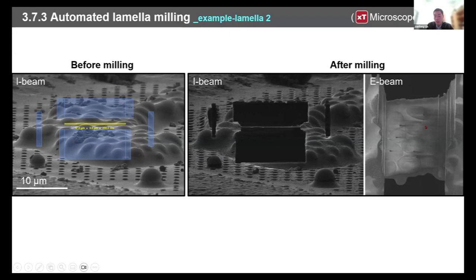In these images, you can see, even though here you will see a little bit of feature, it's still not good enough for you to study. And here you see the black spot just inside your sample, where the material is different. That is also another example that the planning is important, to make sure to avoid curtaining caused by different density of the sample.